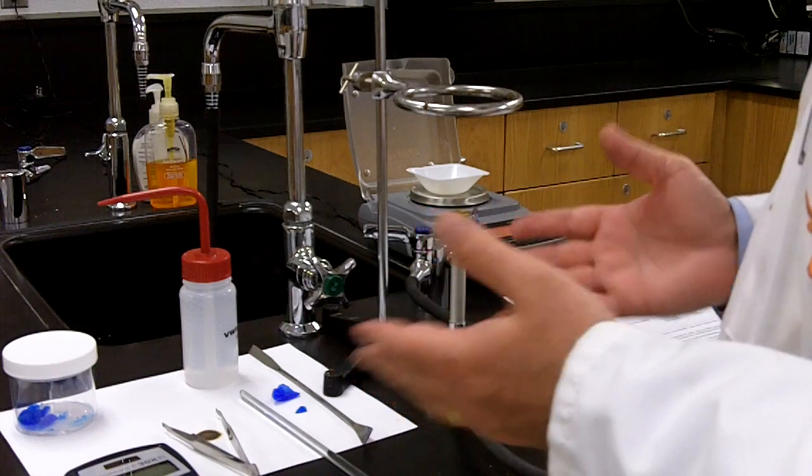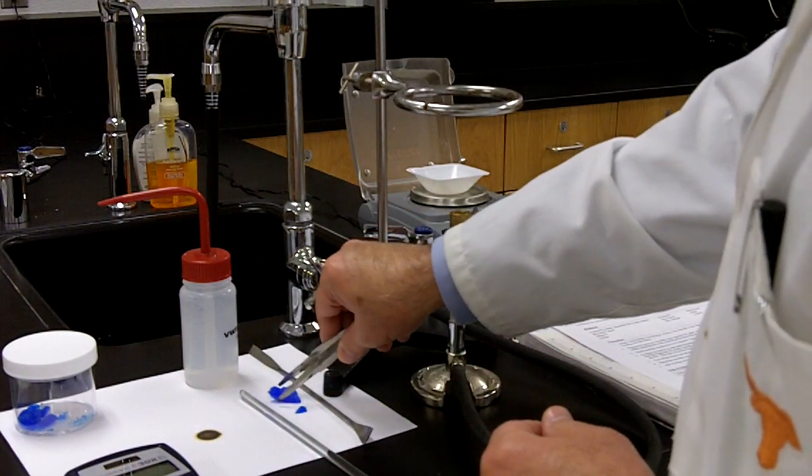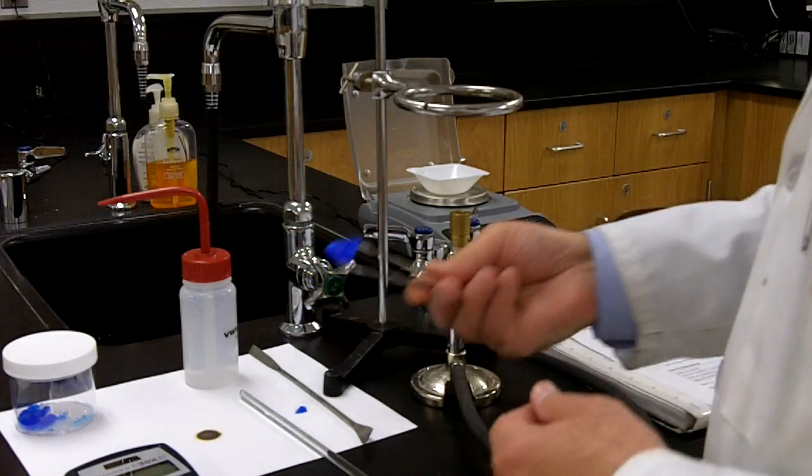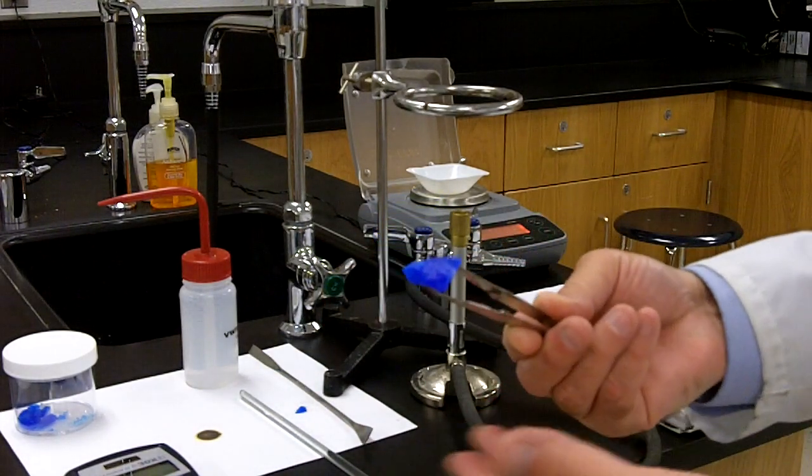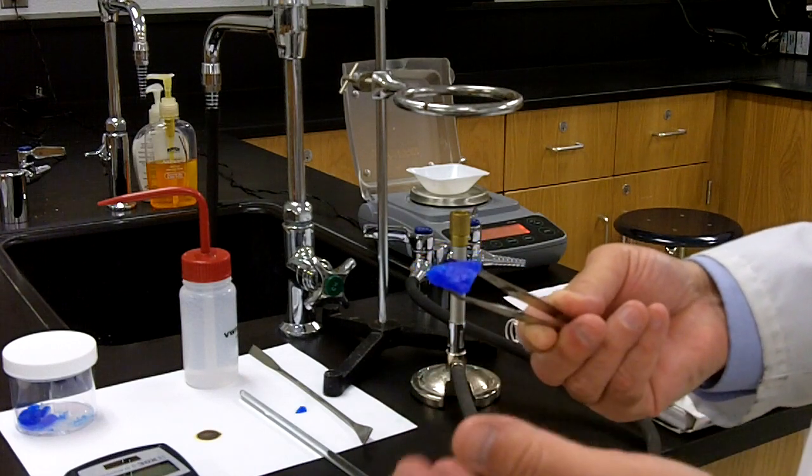So I guess a good place to start would be to ask the question, what is a hydrate? Well, a hydrate in this case, the one we're going to be using today, is called copper 2 sulfate pentahydrate. This is a beautiful blue crystal, and as you can see, it's a very deep blue color, and it contains water.